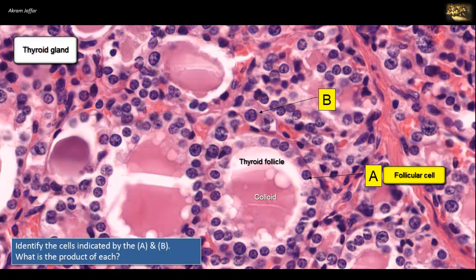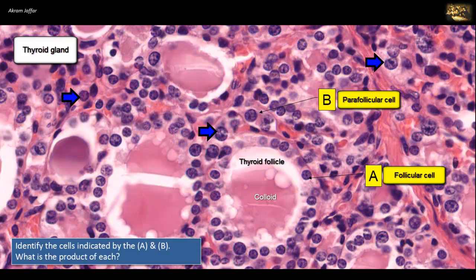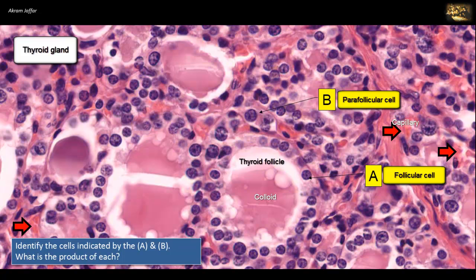Cell B is not located within the follicle — it is around the follicle, hence parafollicular cell. They are also called C cells because they produce calcitonin. When blood calcium level is high, calcitonin inhibits osteoclastic activity, functioning opposite to parathyroid hormone. The parafollicular cells are individual cells mainly located in spaces between the follicles, larger and paler than follicular cells. This parafollicular tissue contains capillaries with red blood cells and a meshwork of supporting connective tissue — a classical endocrine arrangement where secretion goes into the blood with no ducts.